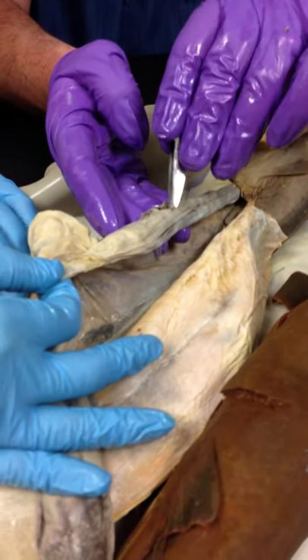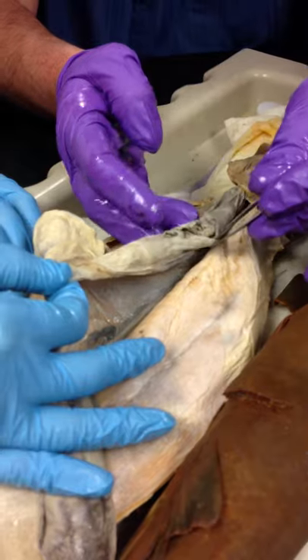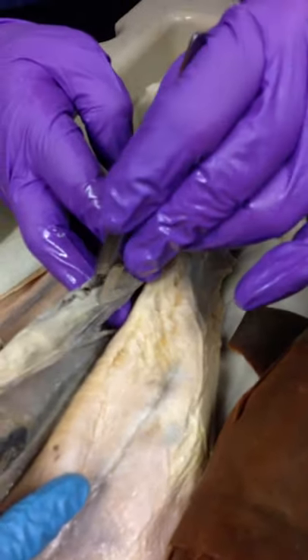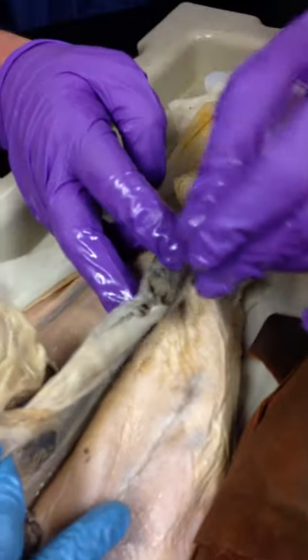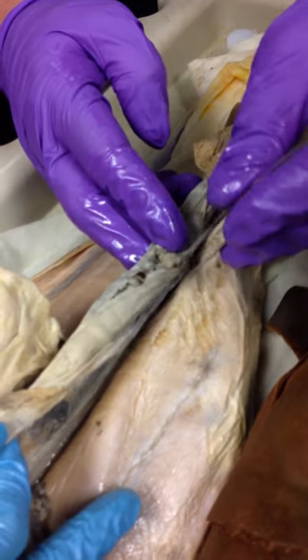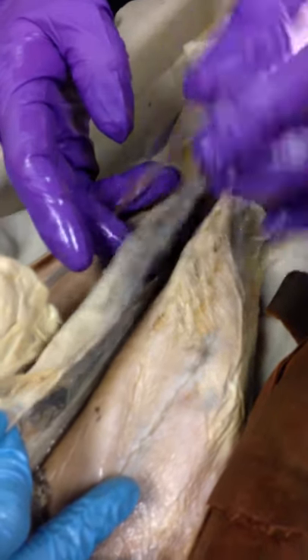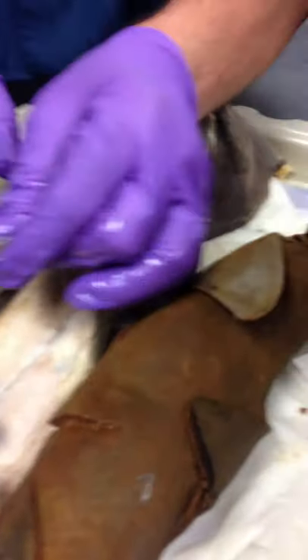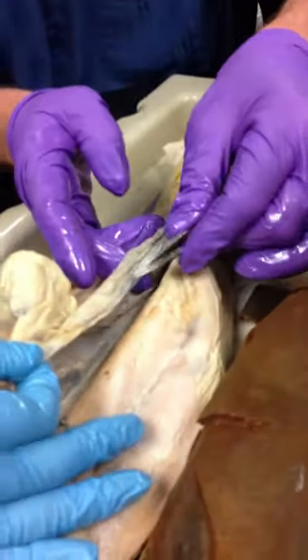Well, they have a special structure inside. So if I open this, you can see those layers, right? See those little lines going across? Here, look like that. Oh, no, come on. So those lines going across? That's a structure inside the ileum called the spiral valve. So instead of the food going straight through and making that sound and being annoying, instead, it has to go around and around and around.